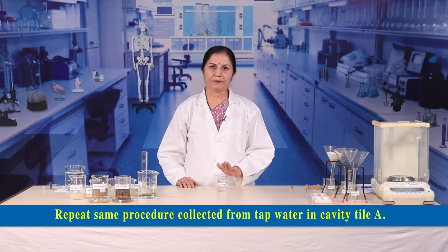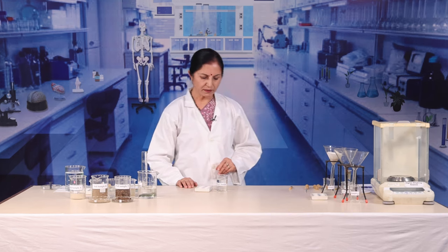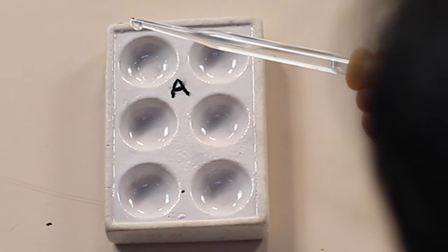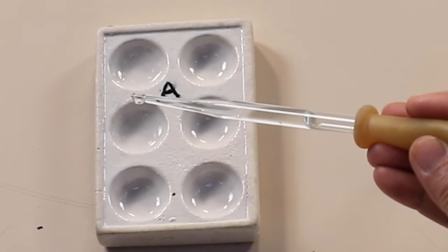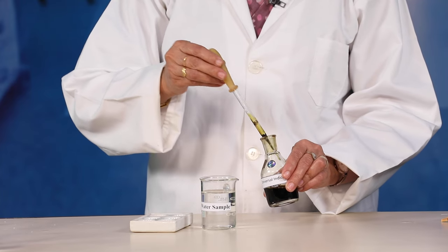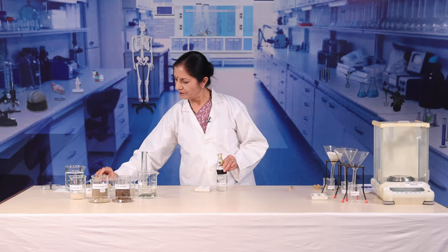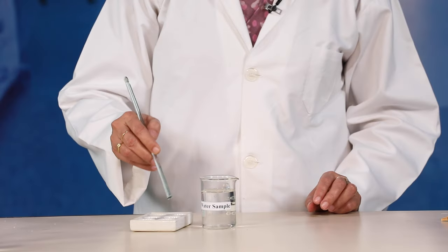Follow the same procedure for the water sample collected from tap water. Note the pH of the water sample in the same manner. Collect 5 drops of water and put it in the first cavity. Similarly, in the second and third cavity. Add universal indicator solution, 1 to 2 drops in the first cavity. Mix the content with a stirrer.